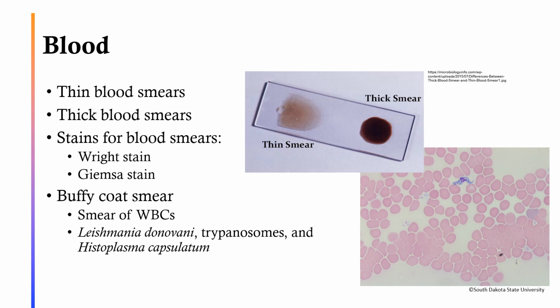So blood parasites are also a common type of parasite that is analyzed within the laboratory as well. We can perform two different types of smears. The thin blood smear, which essentially is made up like a peripheral blood smear. This is where we're going to look for microfilaria, and we examine almost 300 plus fields in order to look for these parasites. Typically, the feathered edge is going to be examined for intracellular and extracellular parasites.